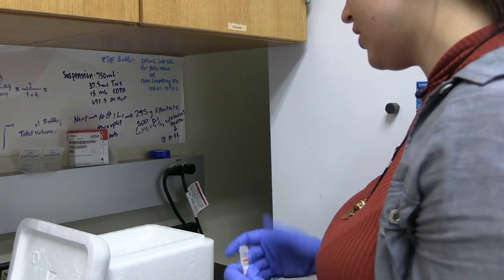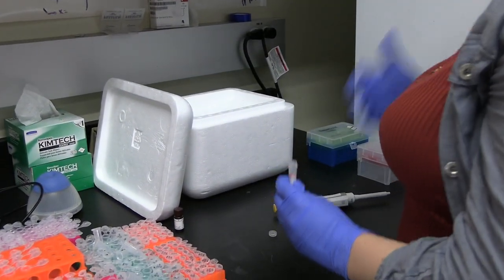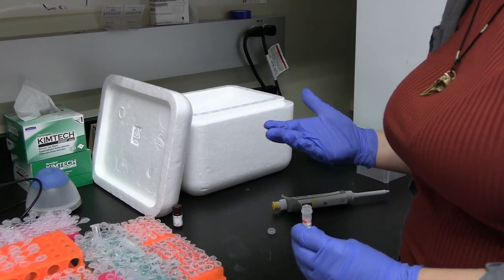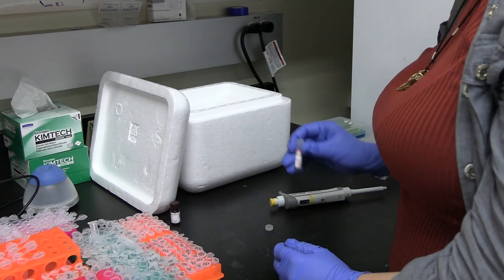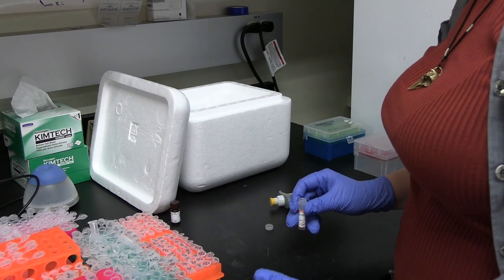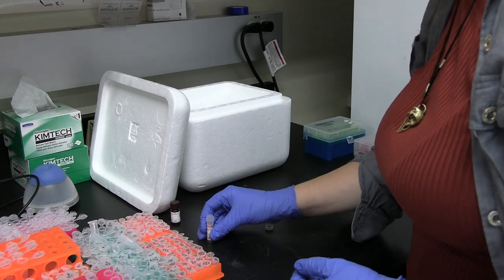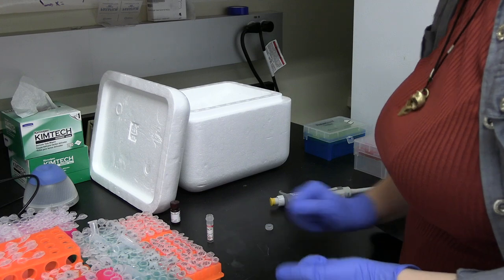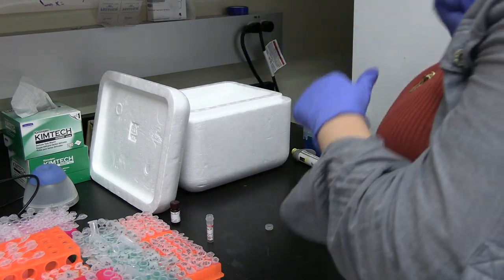Okay, the thing about DMSO, so phalloidin is stored in the minus 20. Ideally, you want to keep these chemicals cold when you're aliquoting them, but the thing about DMSO is that it freezes instantly if I put this on ice, and we want to avoid as many freeze-thaw cycles as possible because that can actually damage the chemicals. So what I'm going to do is just very quickly aliquot this into 2.5 microliter aliquots, throw those on ice, and then we'll throw those in the minus 20 when we're done.